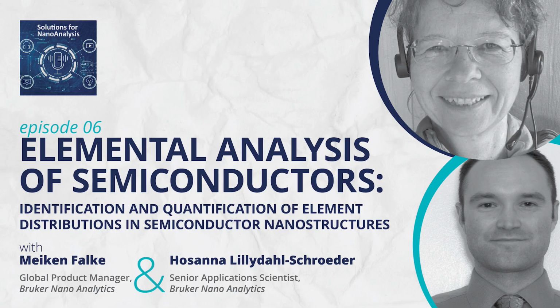Also, whole chips are getting delayered, and one looks at different levels, I guess more on the length scales of several tens or 100 nanometers and micrometers. And if we are talking whole wafers, then this is already centimeters. The scale so goes from really large to very small, and I think before there sits micro XRF and then SEM and then TEM. So all of these microscopes have advantages, but let's stick with the TEM first.